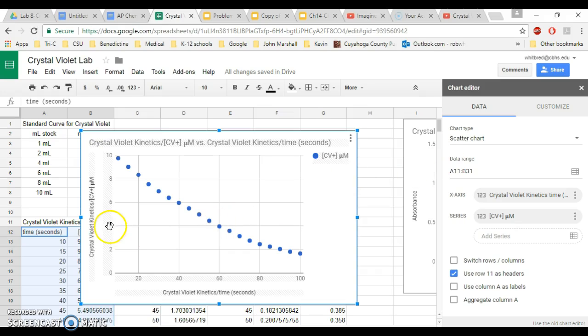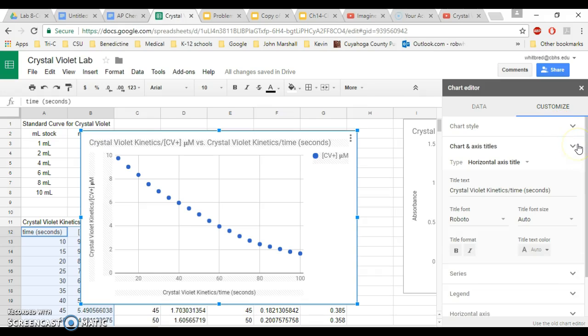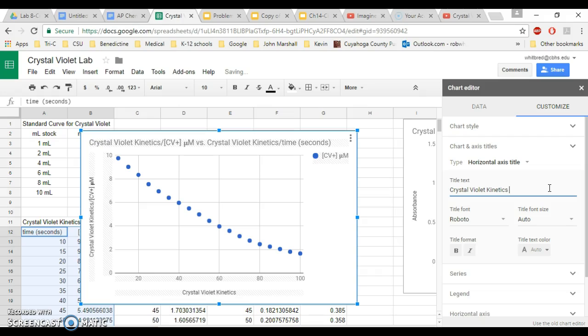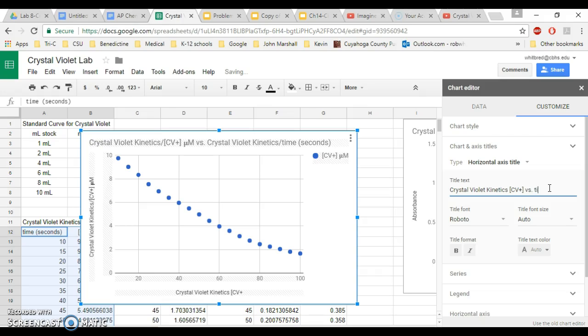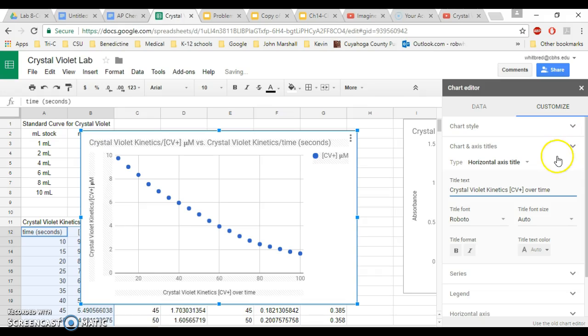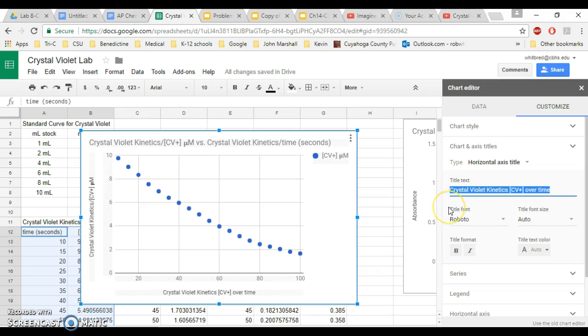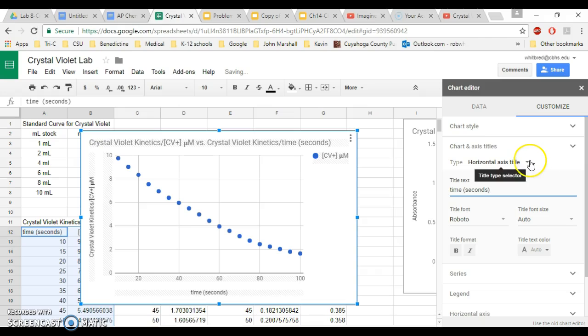So in this case, the first thing that I'm going to do is I'm going to go under customize and I'm going to set up all of my chart and axis titles. So this is crystal violet kinetics. I don't really want all that. I'm going to crystal violet kinetics. CV plus versus time over time. And then you're going to close that. That's under horizontal axis title, so instead I'm going to leave this as time in seconds.